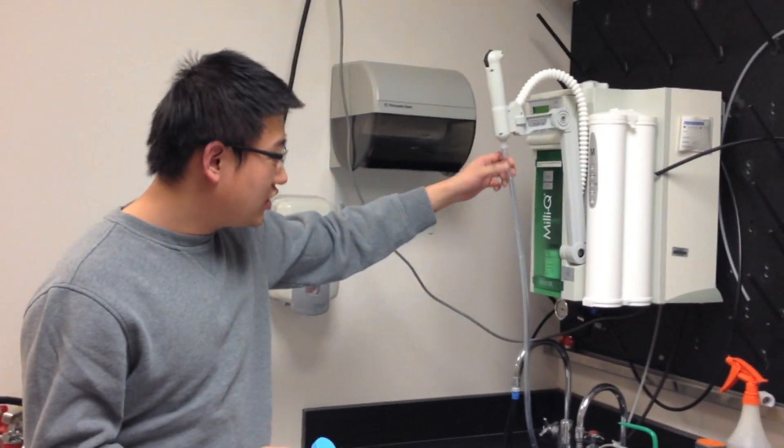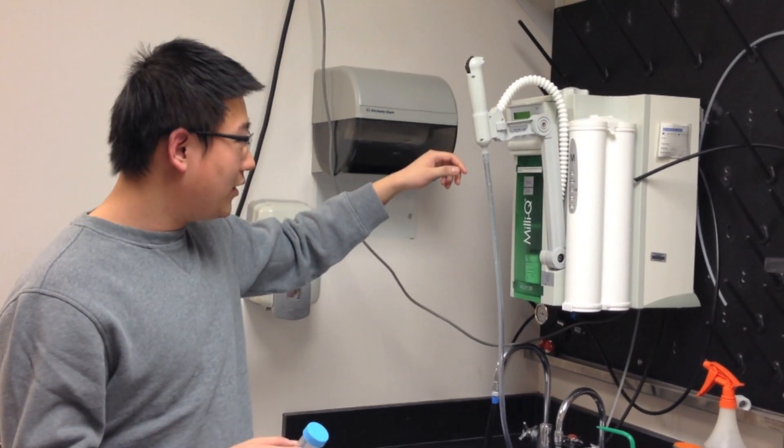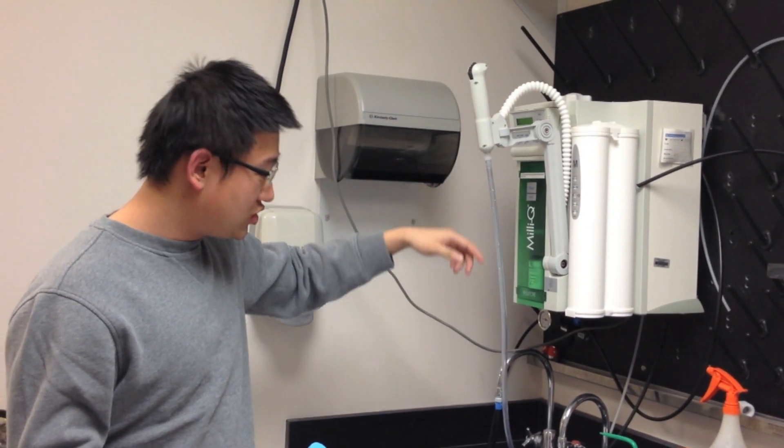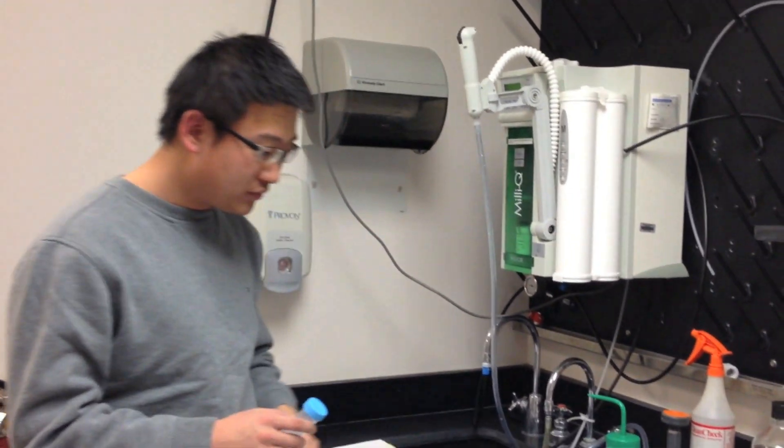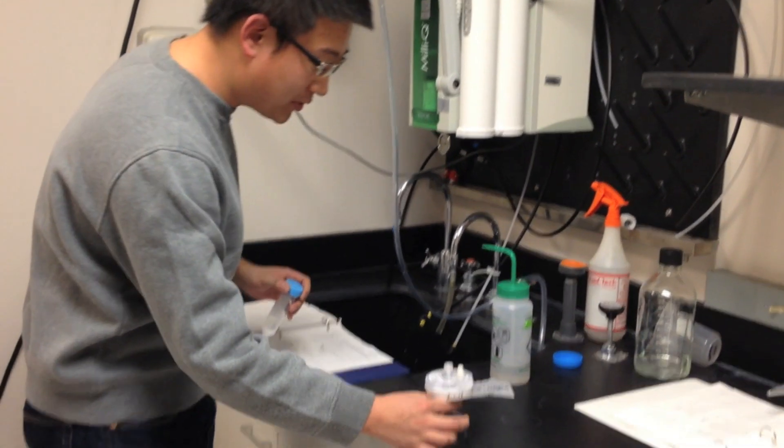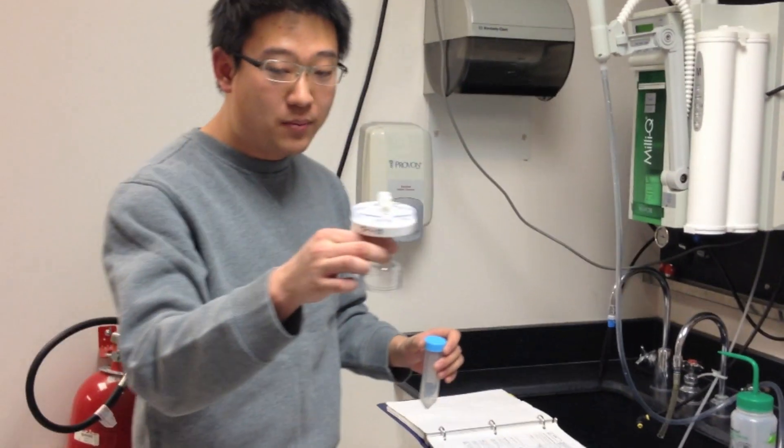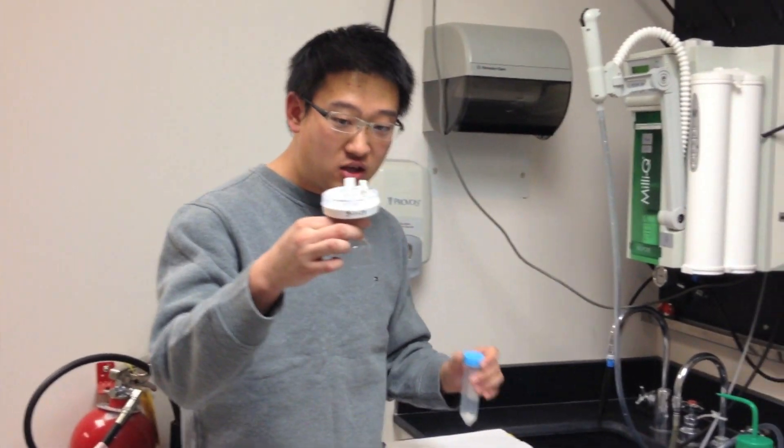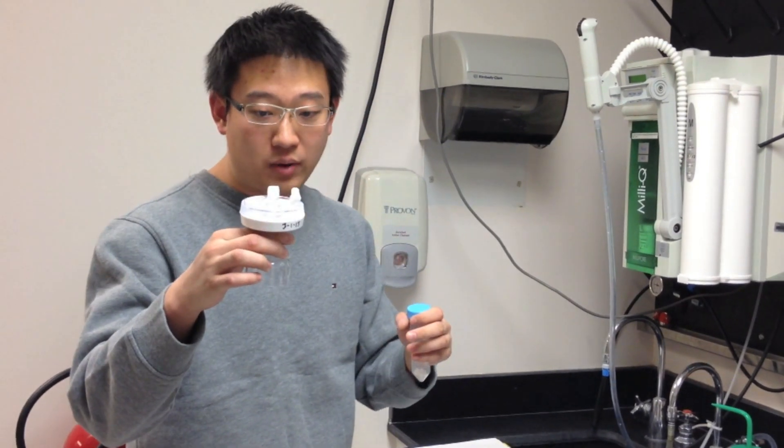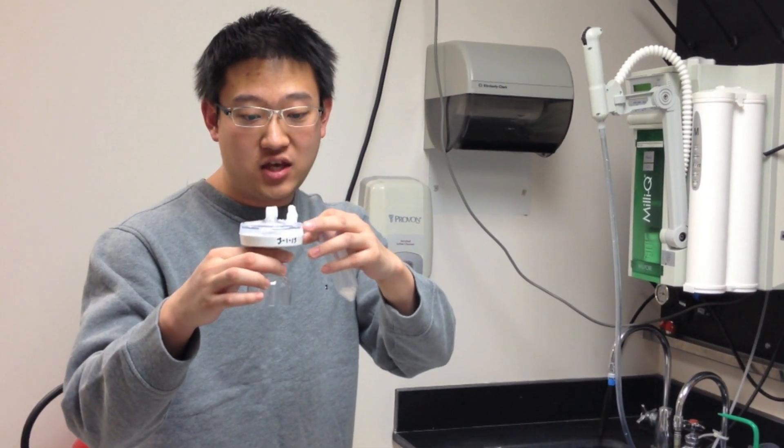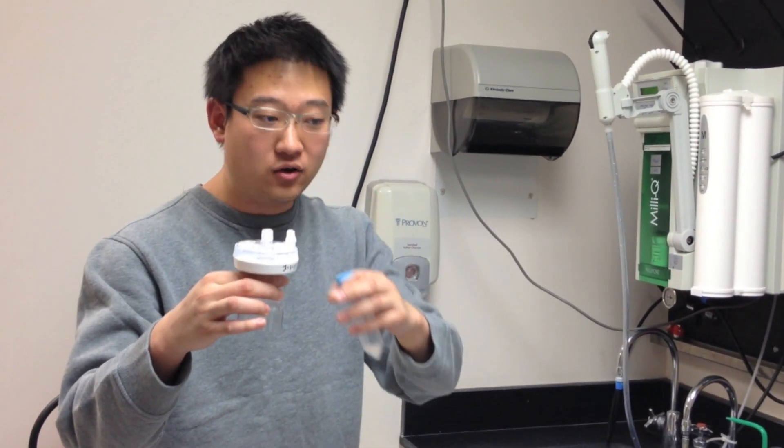You will need this Teflon tube to induce the sodium hydroxide water into the sink. So the first step is to take this mini-pack filter off, and then you need to parafilm. There are three openings. You need to parafilm to prevent the filter from drying out.